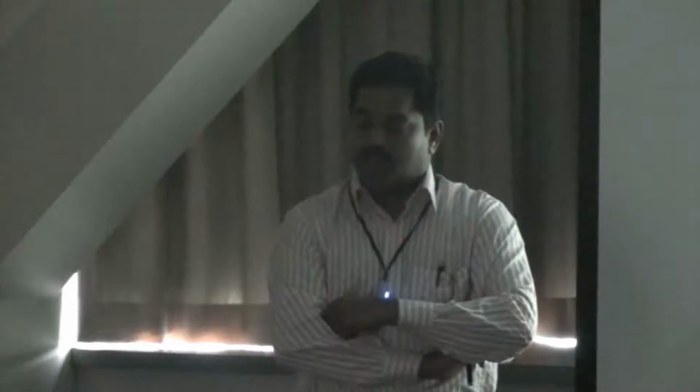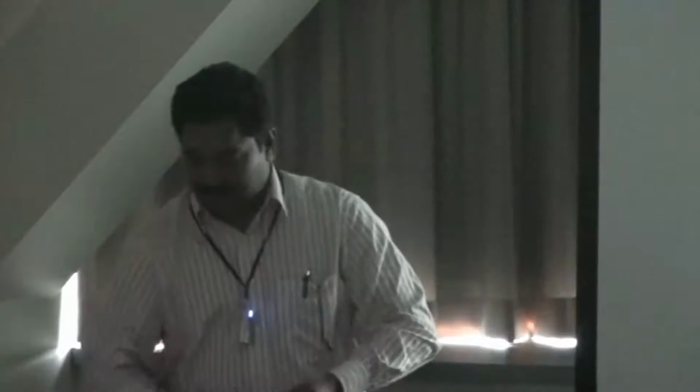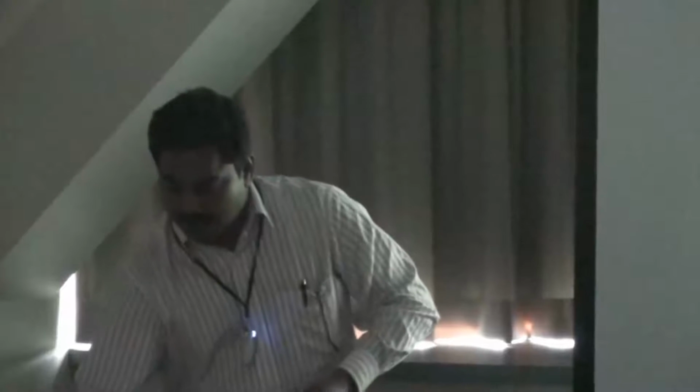And we have a structured illumination super resolution system from Zeiss installed in the IGB. If anyone of you wants to come and use that system, you can contact me at any time.